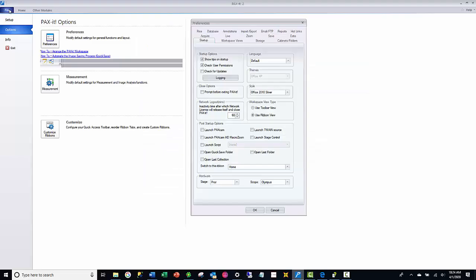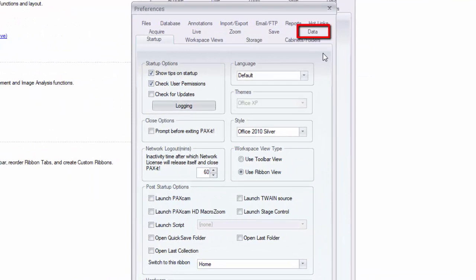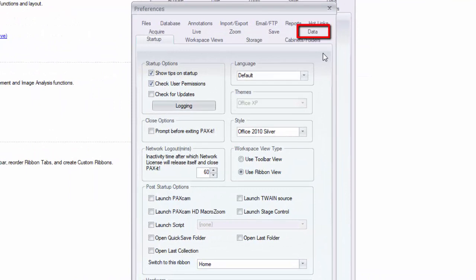Once the database fields are set up, there is a special data tab in options and preferences that allow the auto-populating of certain fields and other special functions. Check out information on how to set up preferences for more details.